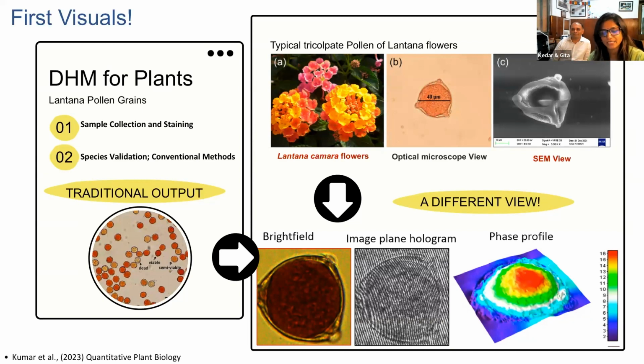Already, this sounds like rocket science to me, and to save you the hassle, I will now hand over the proceedings to Kedar, who's going to explain to you the entire concept of the DHM microscope. Over to you, Kedar. Aage aa jao.